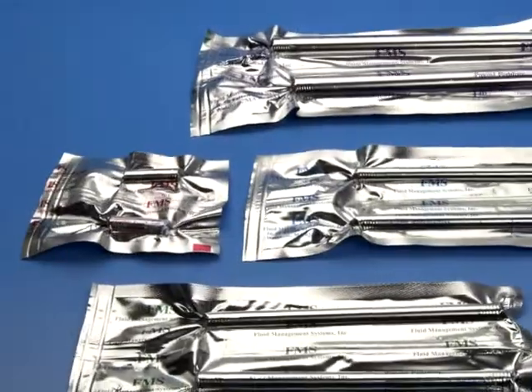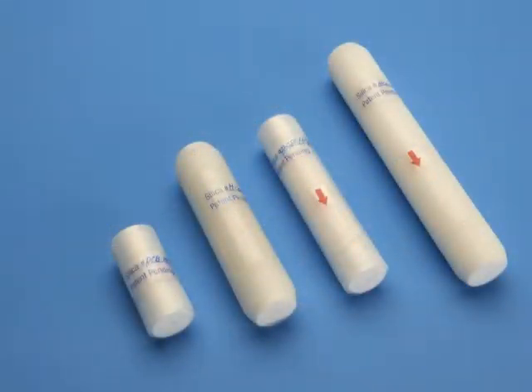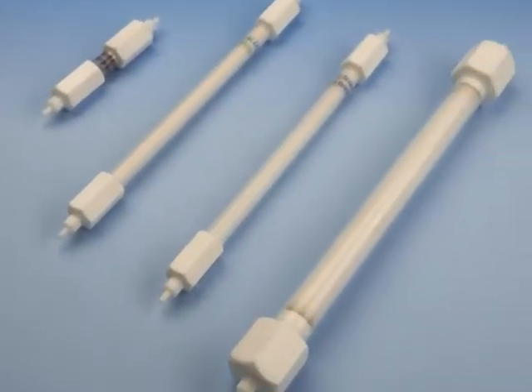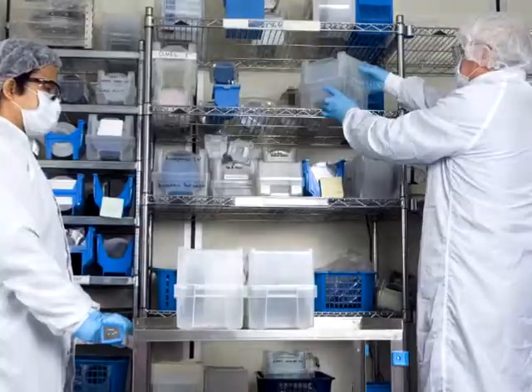The PowerPrep system uses pre-packed disposable columns. FMS's proprietary columns are made from Teflon and contain multi-layer silica, alumina, and carbon. FMS's pre-packed columns are tested for purity and performance prior to shipment, eliminating any chance of errors or contamination to the sample from packing a column in the laboratory.